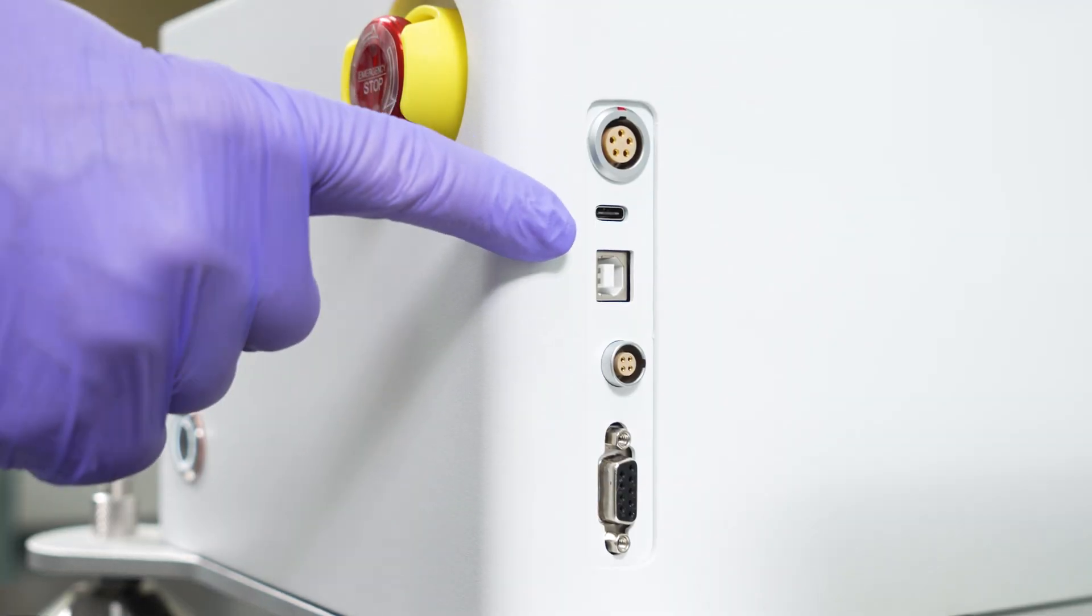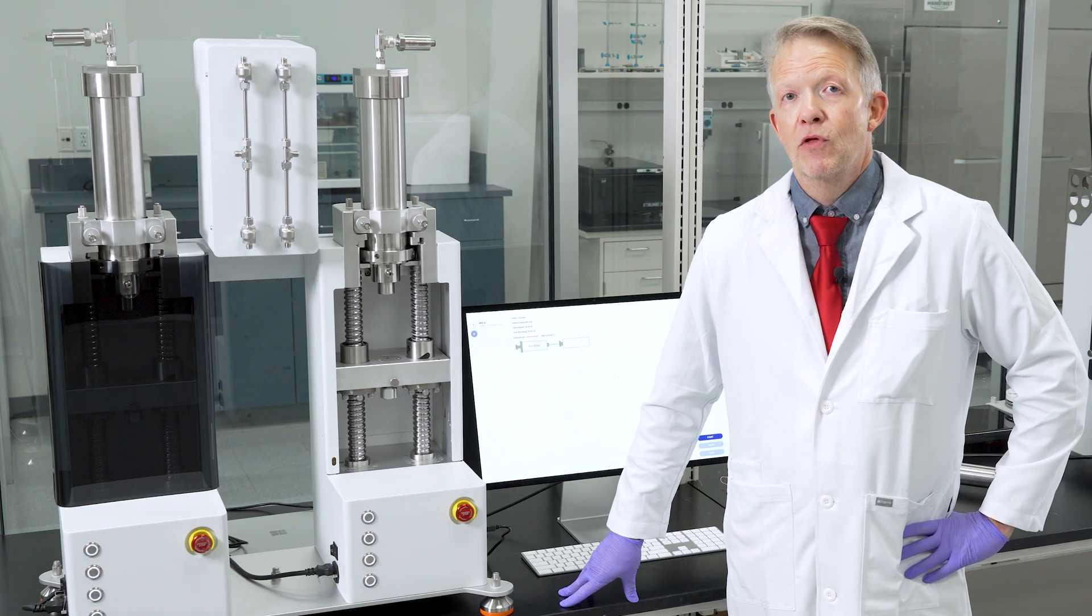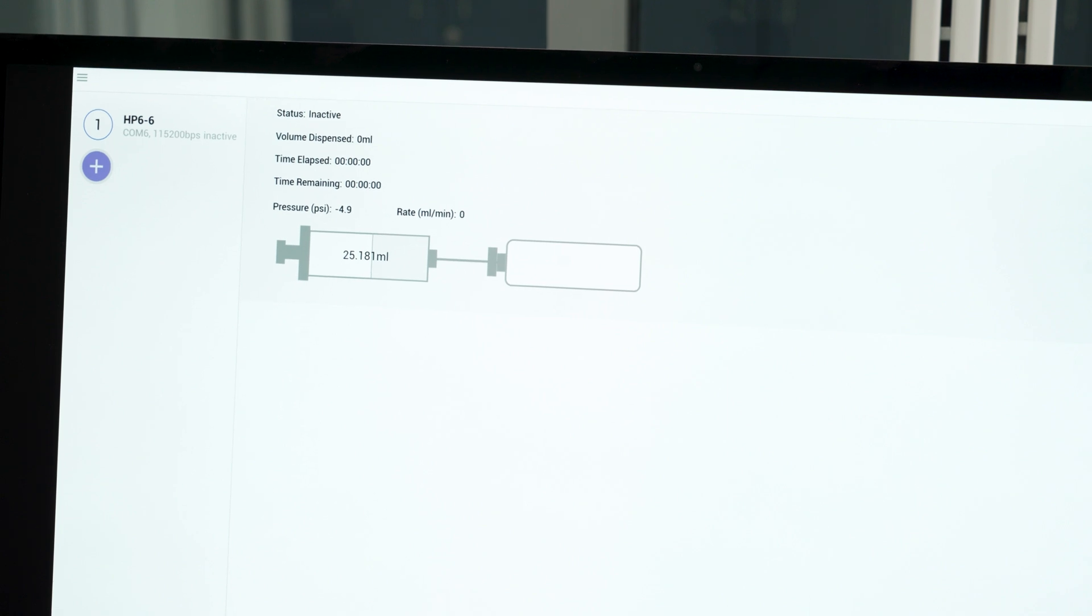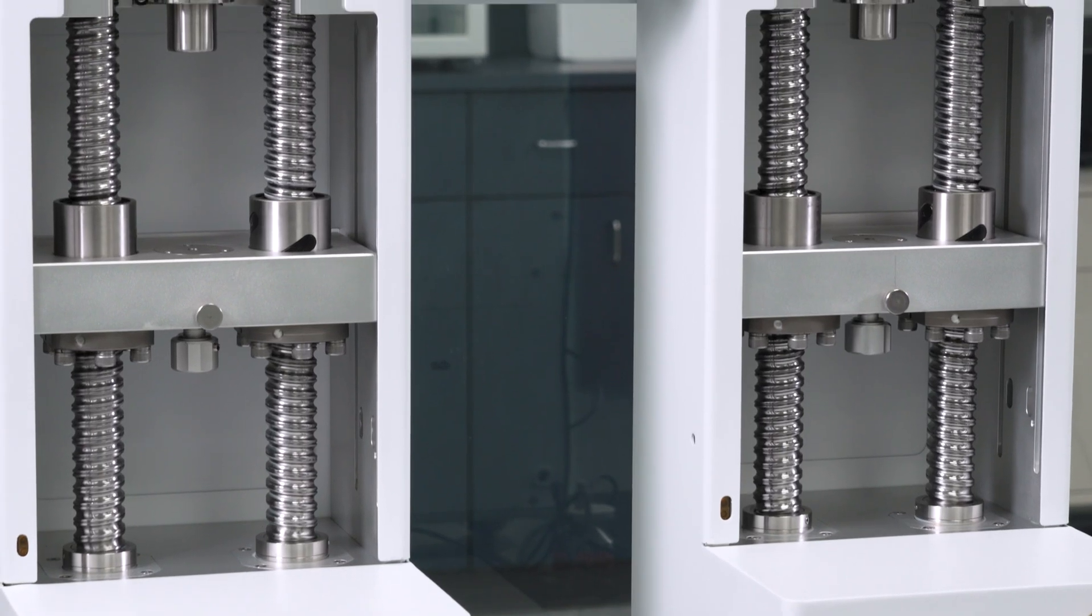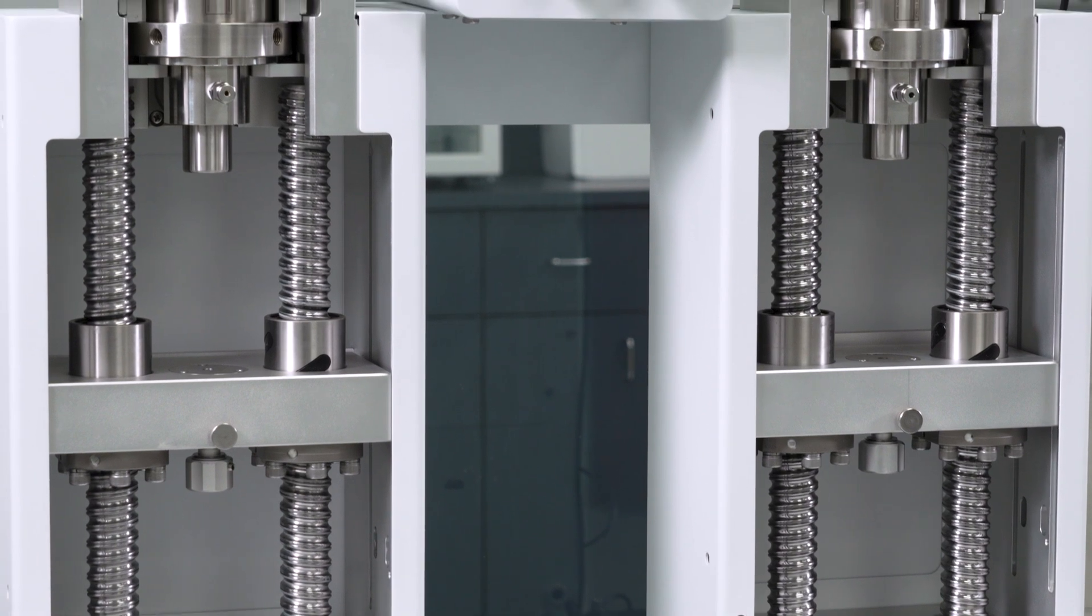The USB and RS232 ports allow infusion and withdrawal functions using the Chemex desktop app. The Chemex app functions include start, stop, pause, syringe volume, and flow rate.